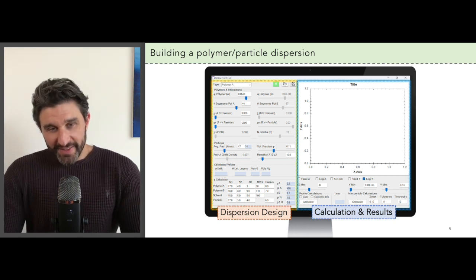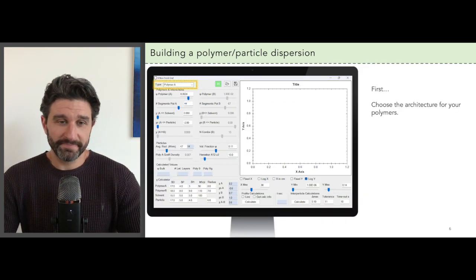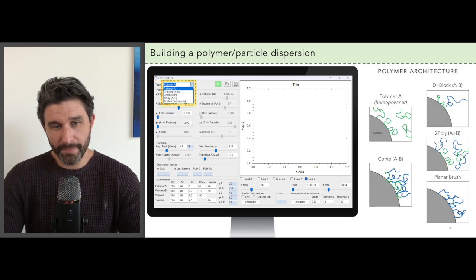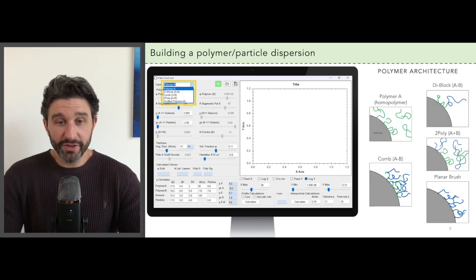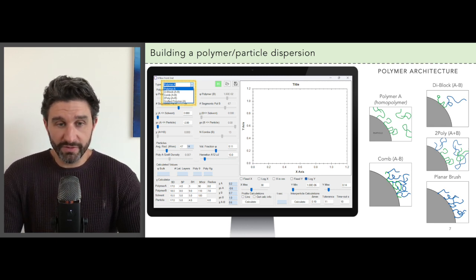All right, so let's walk through how you design a dispersion formulation. First step is you choose an architecture for your polymers. HSP-IP offers a number of architectures that we've discussed in the previous episodes of this webinar.